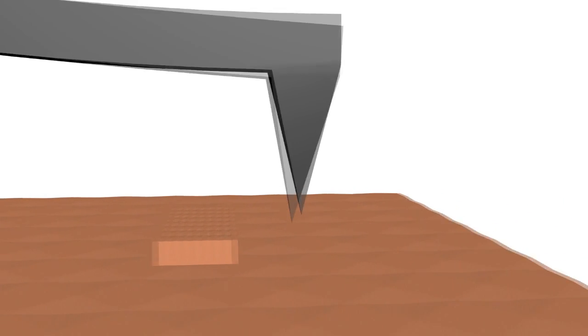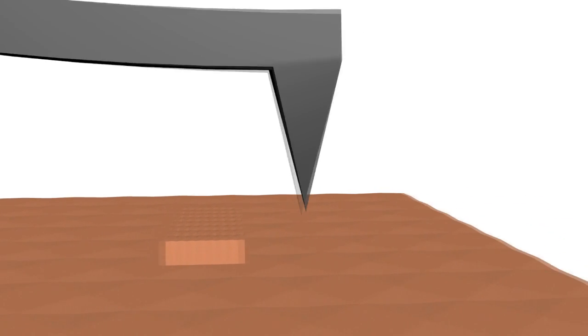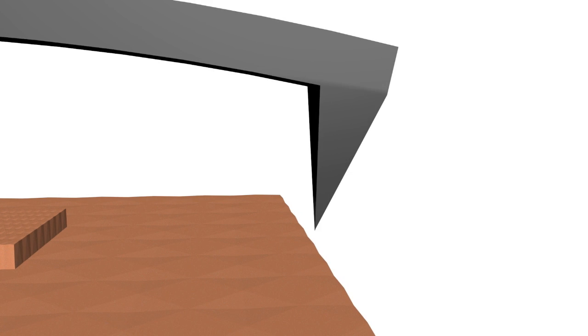In the case of non-contact mode, the tip is vibrating with a constant frequency above the surface. This mode is useful when studying soft or sticky surfaces.